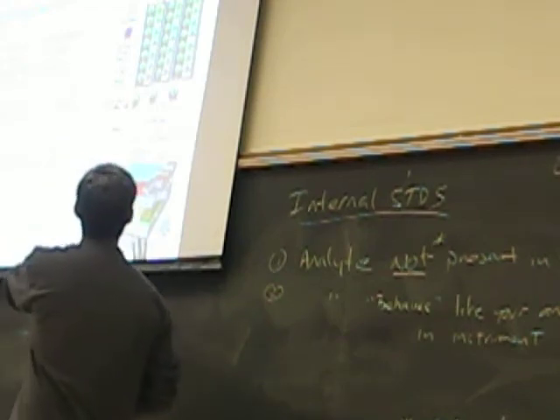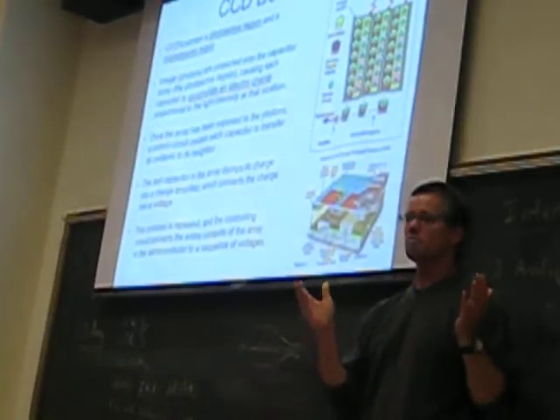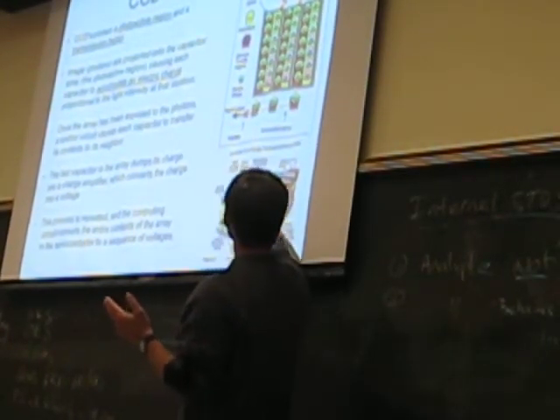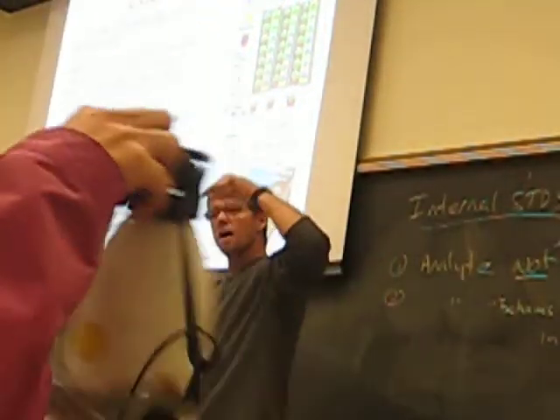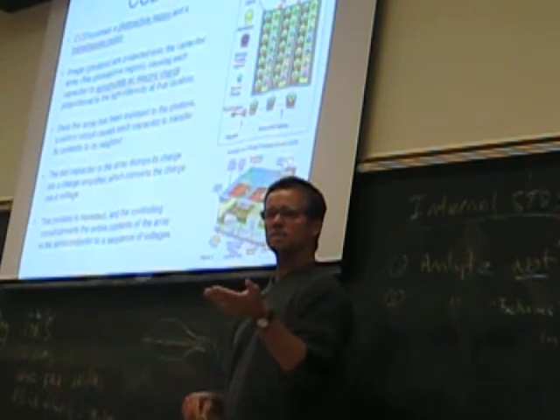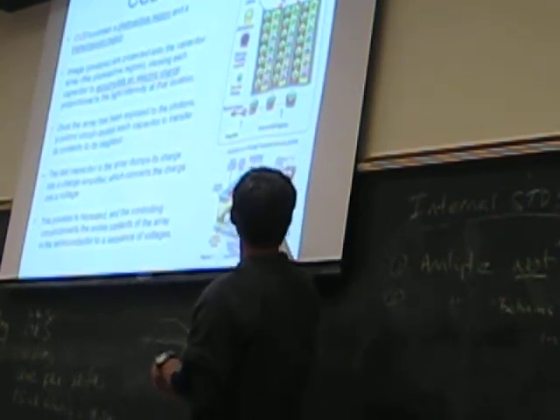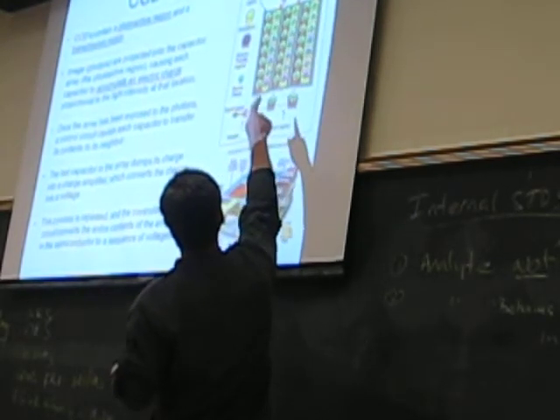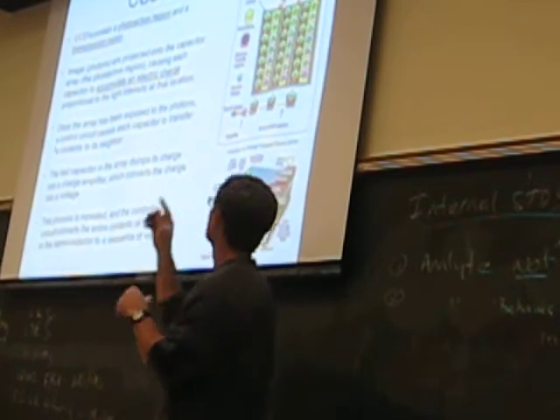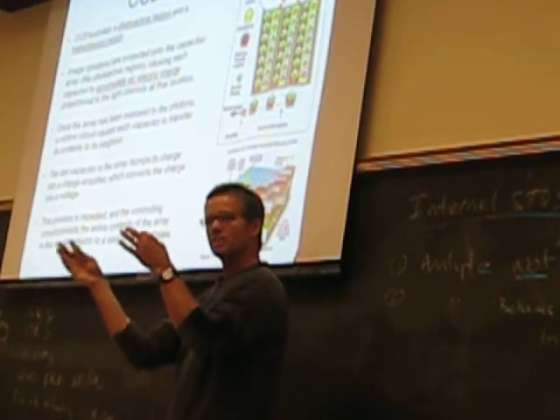The way these work is, this is sort of a cross-section of what this would be. Charge-coupled devices, all of them work by the concept that they have a photoactive surface, meaning that when photons hit that photoactive surface, they generate a release of electrons. That's essential for all CCD detectors. And so when photons hit that photoactive surface, the absorption of that photon releases an electron.